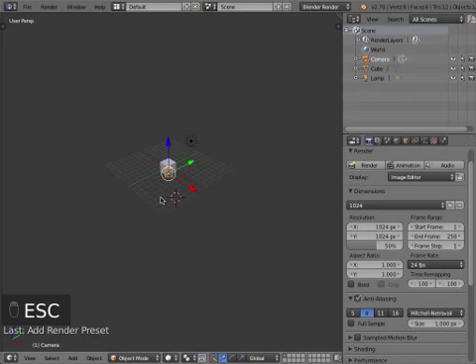Because render times can get pretty long, so you don't always want to render at full resolution. Even though with the techniques that we're going to be using, we're probably going to keep our render times in the seconds range. But if you go very fancy, it can be minutes. I've had renders that took hours. So 1024 by 1024, because it's a power of 2. Try to stick with powers of 2. It makes working with the images later easier.